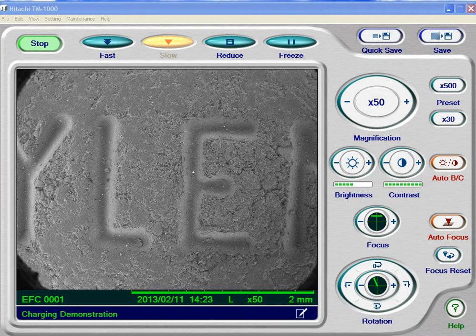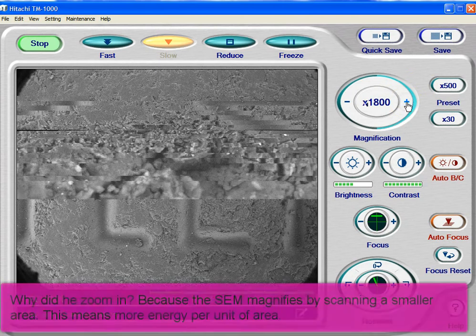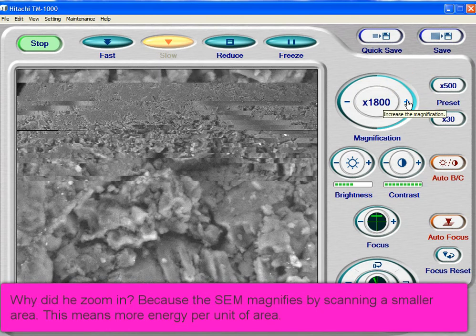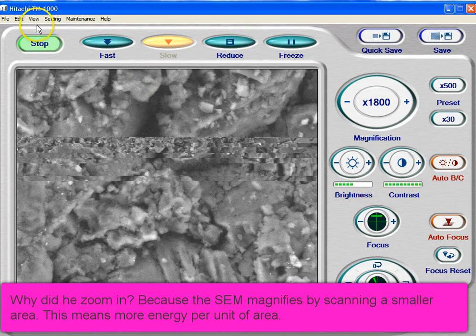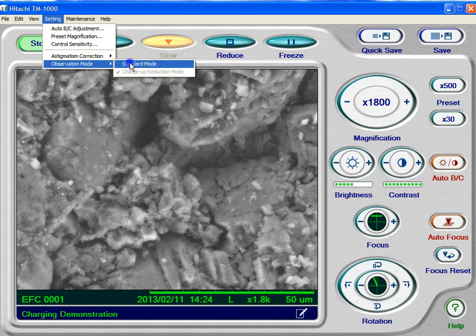What I've got here is a Tylenol tablet, and I use it because it's non-conductive and I know that it will charge up. I'm going to zoom in here to about 1500X, and then I'm going to change the observation mode. Right now I've got this on charge up reduction mode. I'm going under Settings in the menu, observation mode — I'm going to go to standard mode.